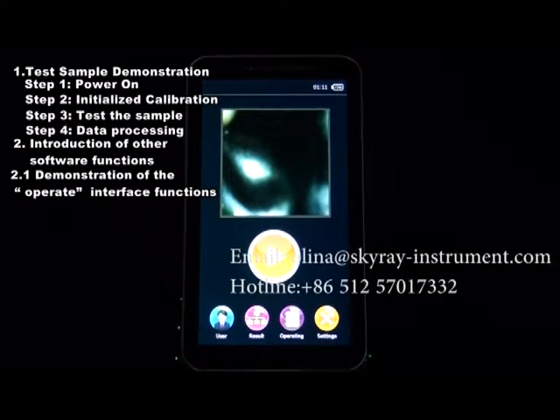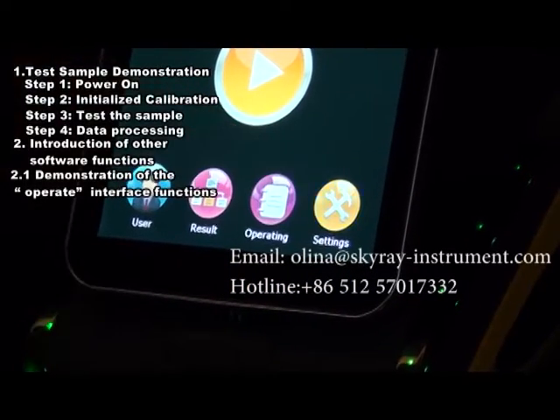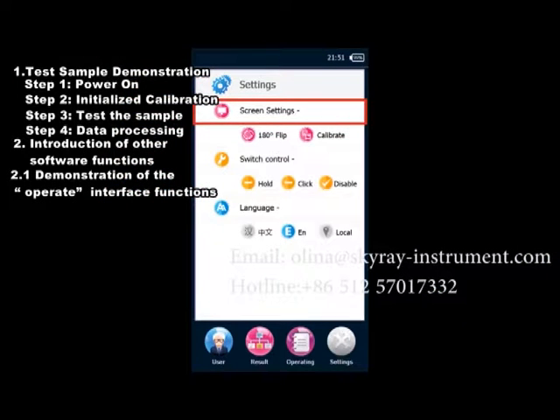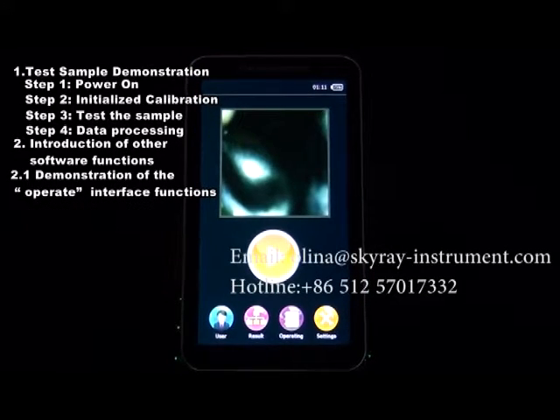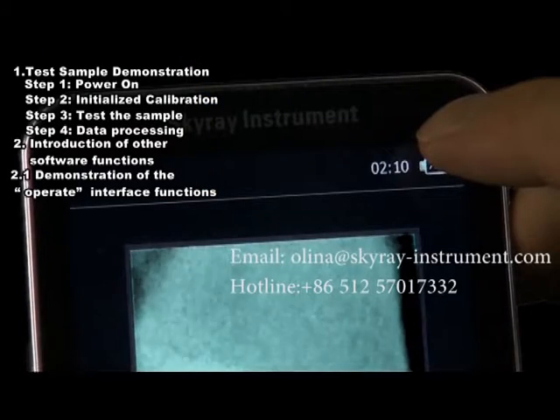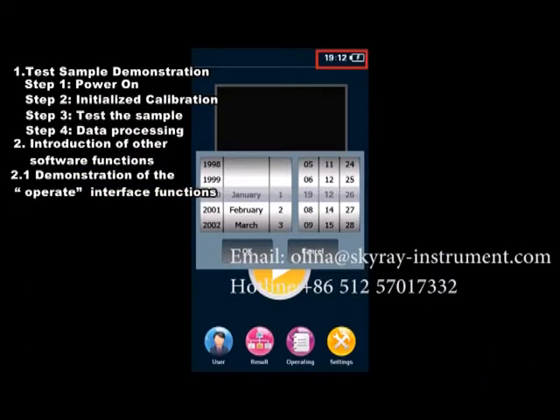Section 2.2: Demonstration of Setup Function. On the main interface, click the Setup button to access the system settings interface. Here you can configure screen rotation, screen calibration, trigger pulling mode, and software language. Section 2.3: Demonstration of System Time Setup. To set the system time, double-click the time display at the top right corner of the main interface. The time setup interface will pop up, and you can set the system time according to your current time zone.